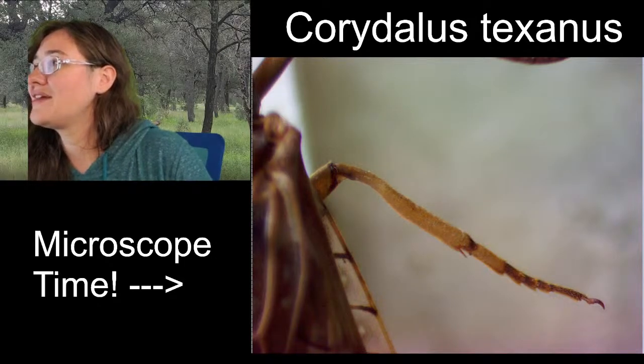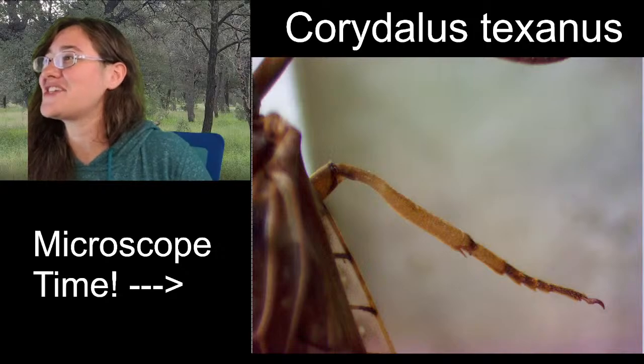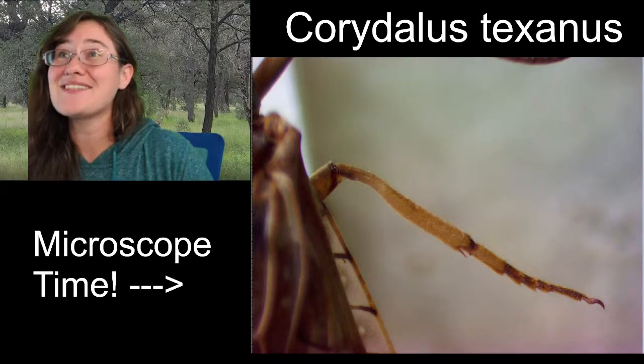Wait a minute. Quick, add some Dobsonflies to your sketches. Yeah, so that's funny. Yes, they're found in riffles.